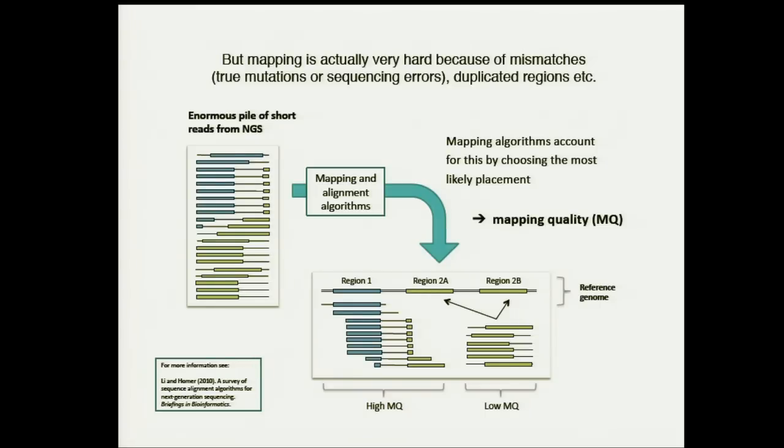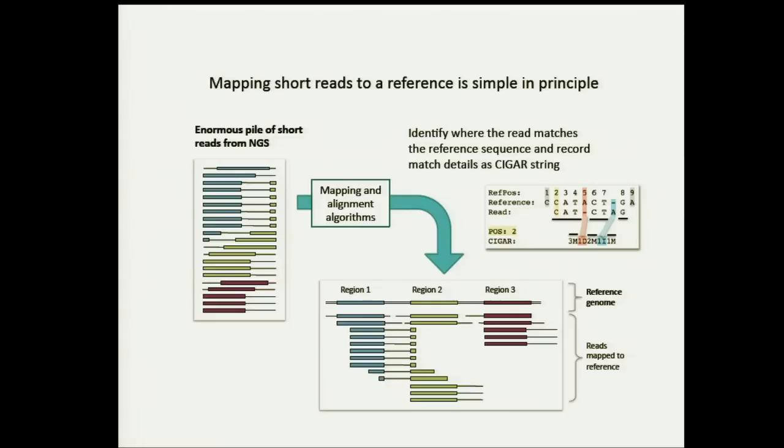So going back to the previous slide, I want to point out the Cigar string, which is the diagram here to the right. This is the way that the aligner has to represent the alignment part of this two-step process, the mapping and alignment.